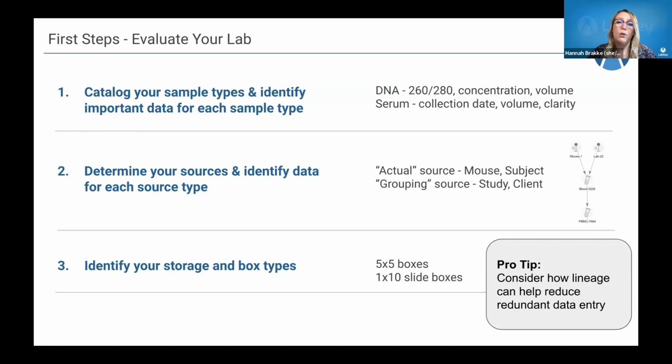So capturing where your data is coming from could be considered an actual source. And this is literally like, I extracted this serum from a mouse or a subject, or I collected this pond water from this pond, to be able to capture that information and metadata about the sample.